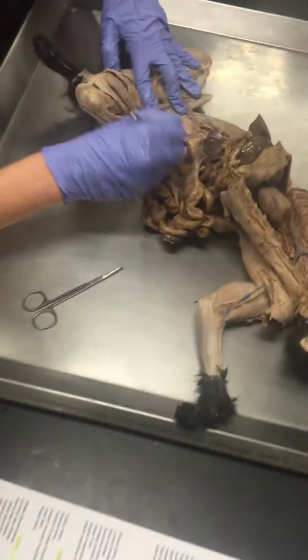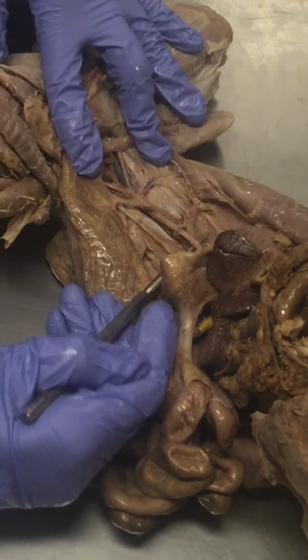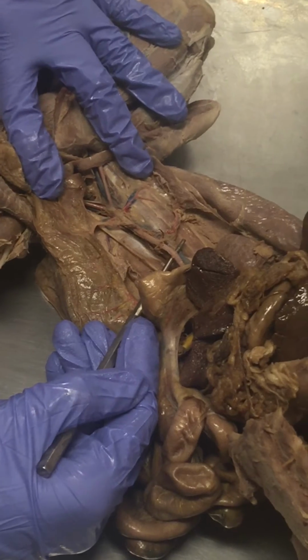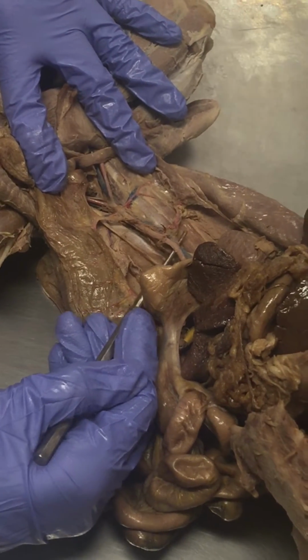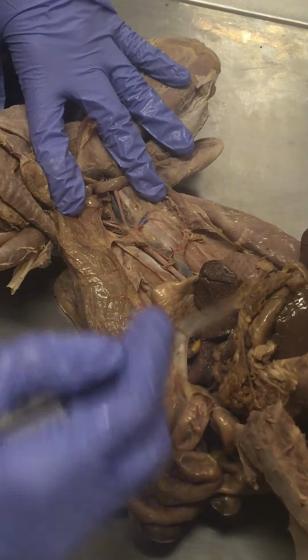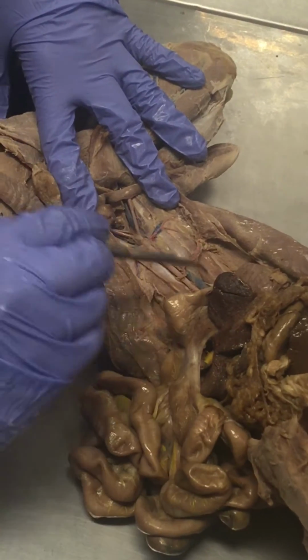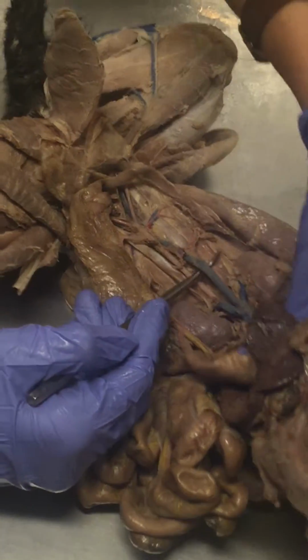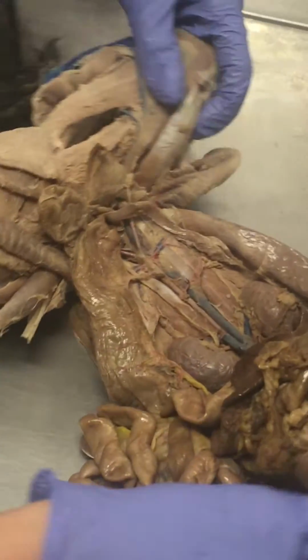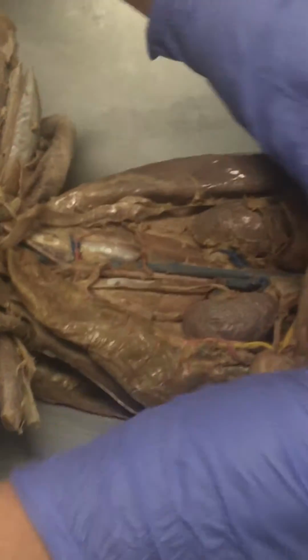This big artery here? That's a big bale. What's this? The big old artery running right down the abdominal cavity. The aorta. Remember, the aorta runs from the heart all the way down until it splits, right? And then what's the big, huge vein? You guys can see it. It's the inferior vena cava. There's no good way to show it. Can you kind of see it?